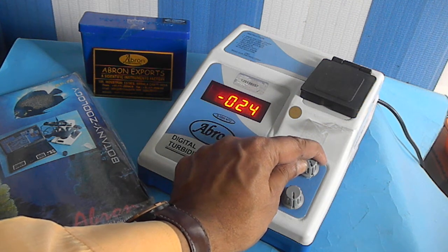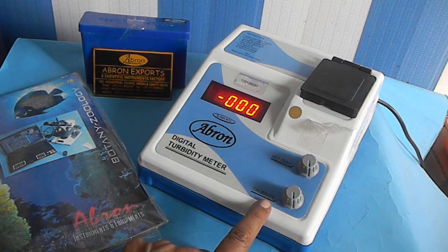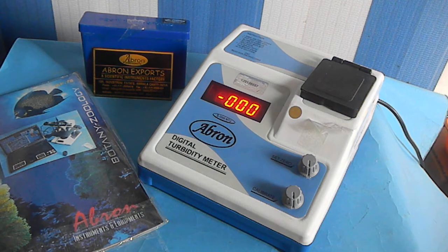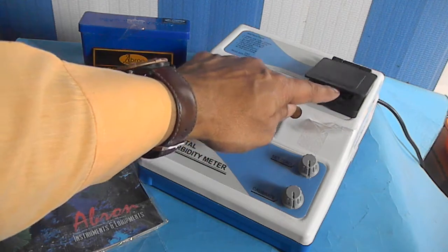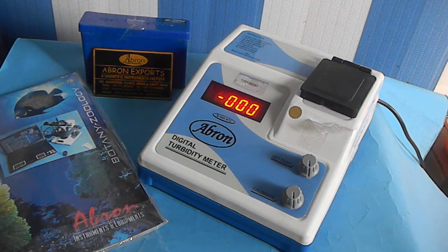After putting the standard solution, bring the reading to 200 or 400 using the calibration knob, as per your chemical. Then take out that test tube and put another test tube with your sample solution to read the turbidity. It is a very easy instrument to use.